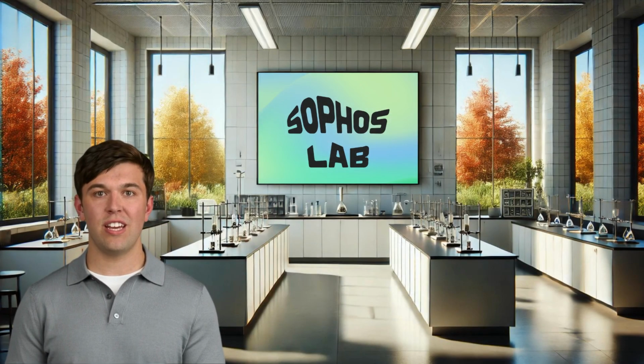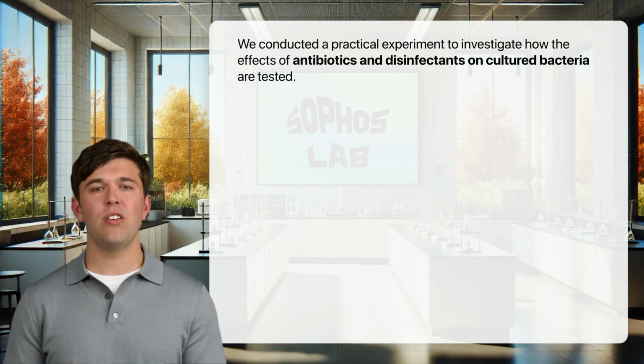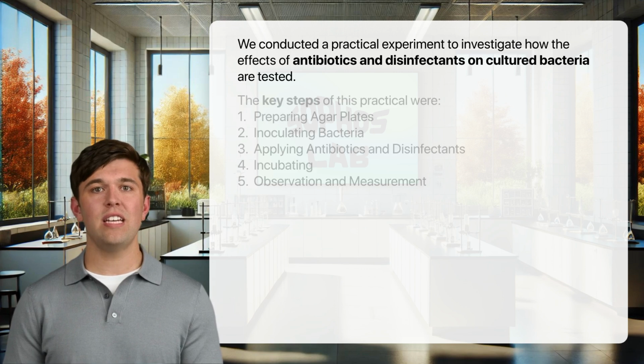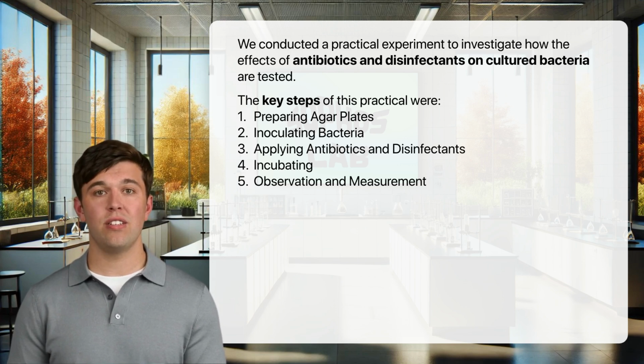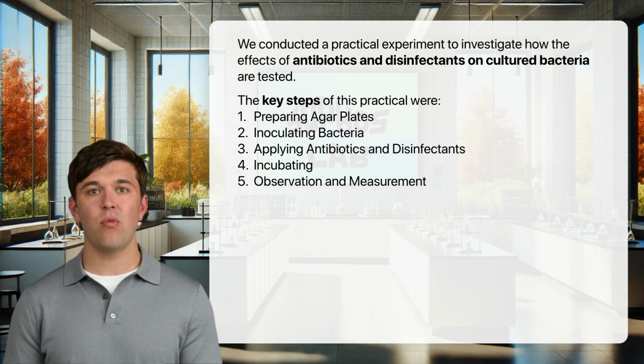That's the end of our lesson today. Let's recap. In today's lesson, we conducted a practical experiment to investigate how the effects of antibiotics and disinfectants on cultured bacteria are tested. The key steps of this practical were preparing agar plates, inoculating bacteria, applying antibiotics and disinfectants, incubating agar plates, and observing and measuring our results.